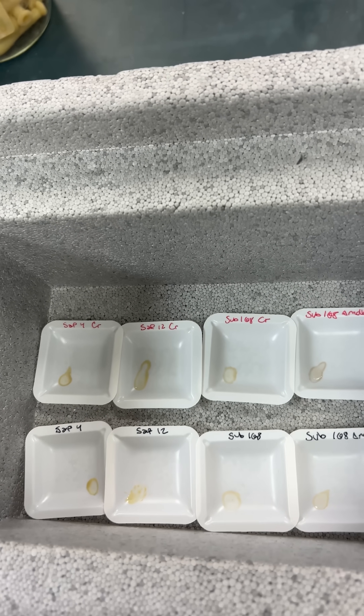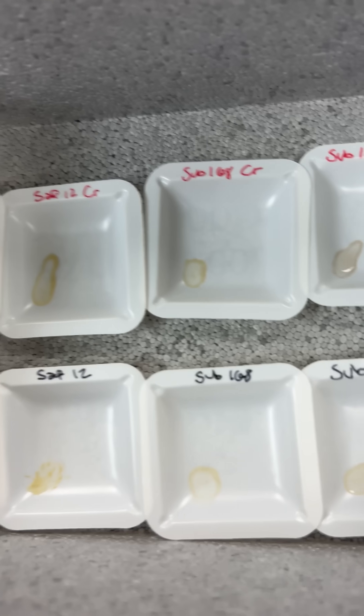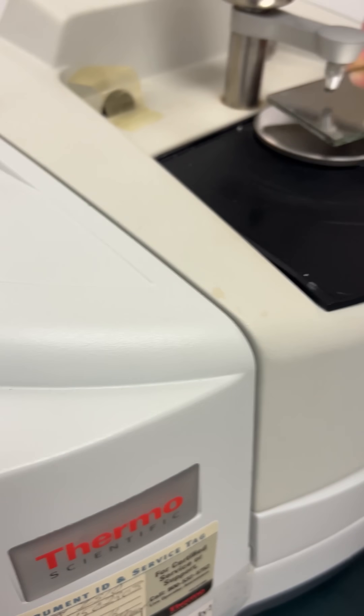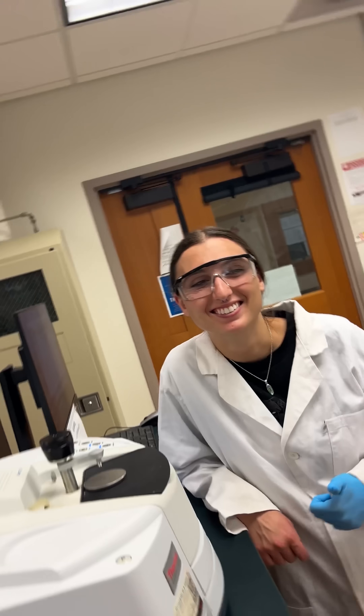We re-suspended a little bit of the pellet and transferred them to these little weigh boats. We're just going to let them dry into films that we're then going to transfer over to the IR. Tomorrow we'll do a side-by-side comparison and see which peaks looked the best.